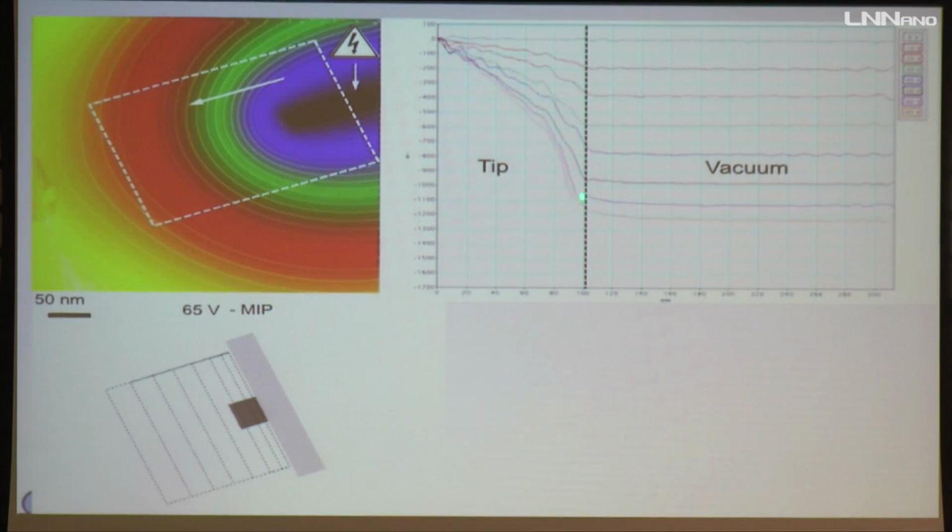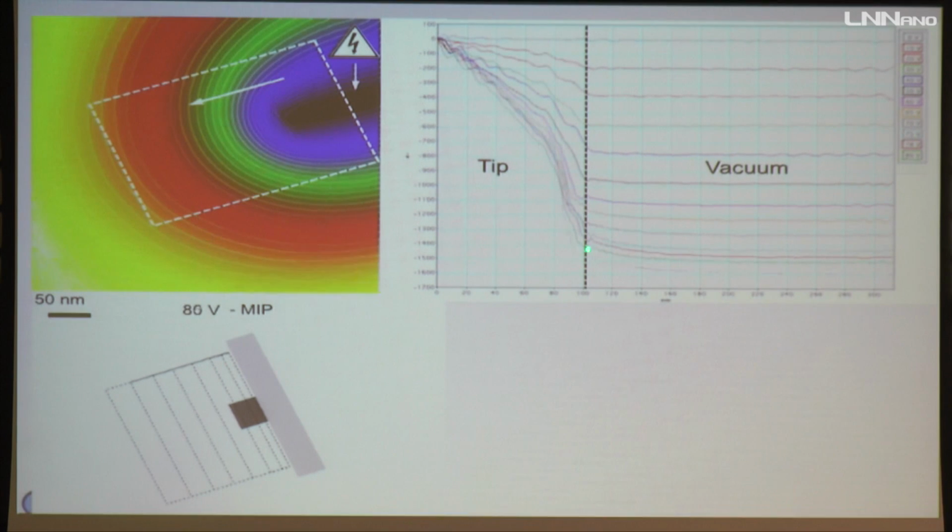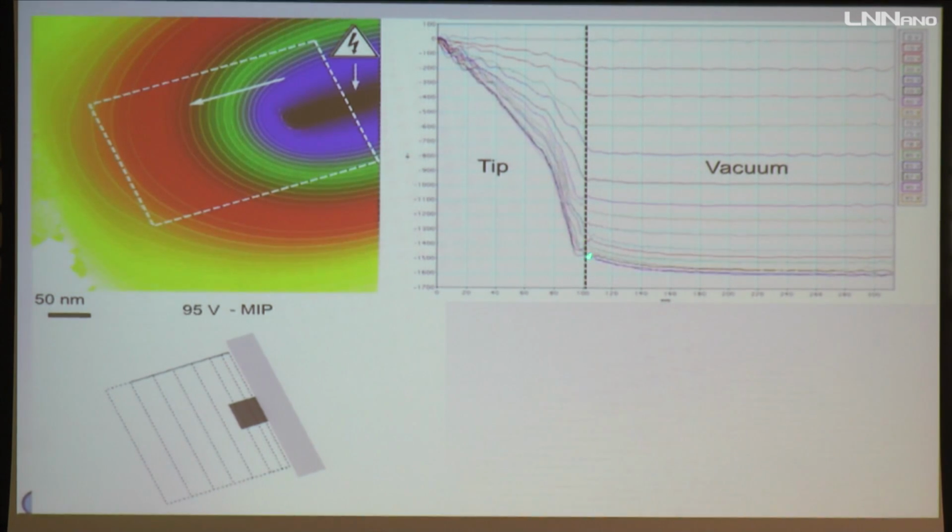Let's do it again, looking at this one. You increase the number of electrons, then you reach the voltage at which electrons are extracted from the carbon nanocone and sent to the anode. So you can make different things. You can determine, of course, the extraction voltage. You can determine the change of density of electrons in the nanocone before emission, okay? And then after, you observe the current.